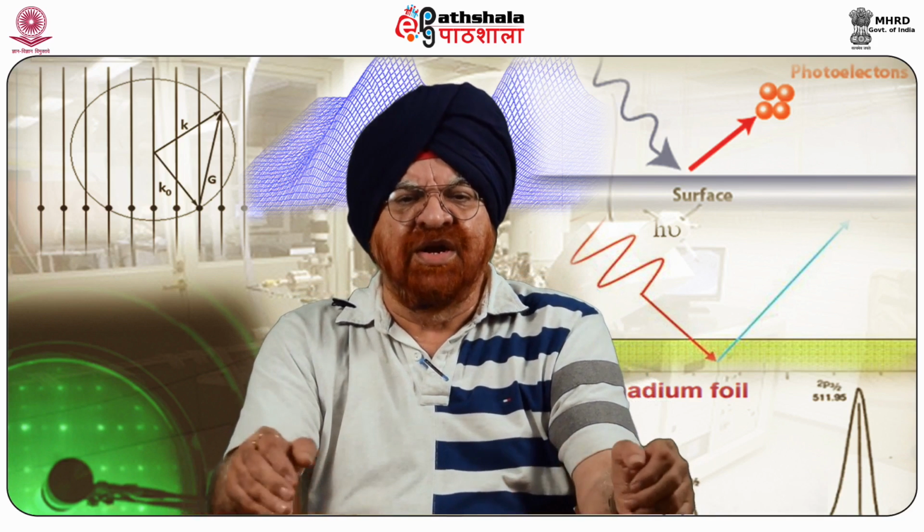Energy analysis of the emitted photoelectrons from the sample atom is the primary data used for ESCA.